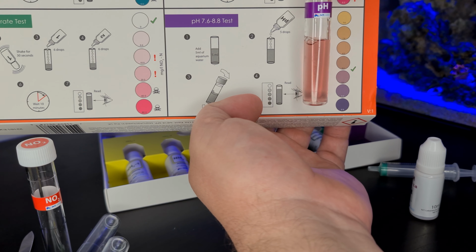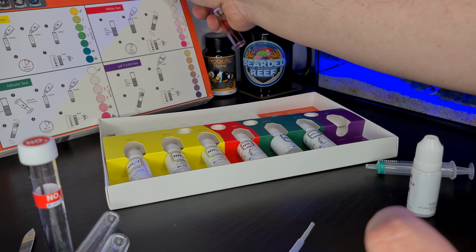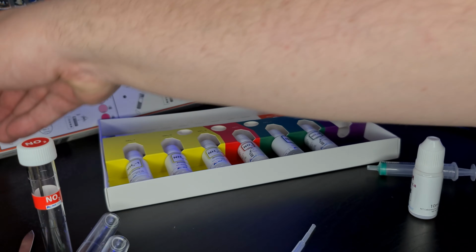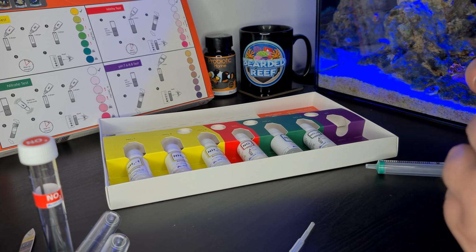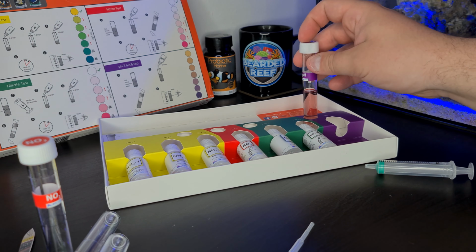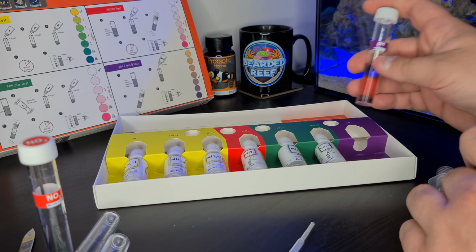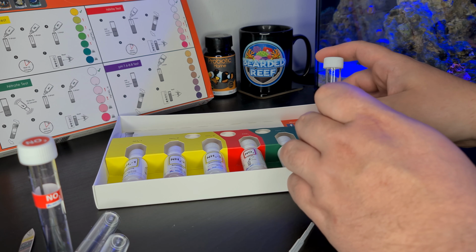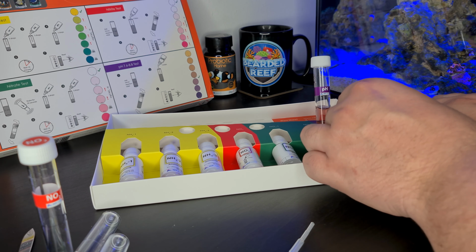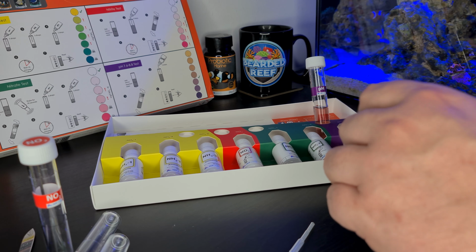But yeah, overall, quite a simple test to do. Quite like that one, that was easy enough. So I'll set that to the side out of the way, give everything a clean up afterwards. But yeah, that's relatively straightforward. In fact, I've just noticed that this does actually have a little stand here that you can sit them in, so sit that pH one in there. That's been done. I'll just make sure that the lid's on tight on this. Yeah, I'm quite impressed with this kit actually.